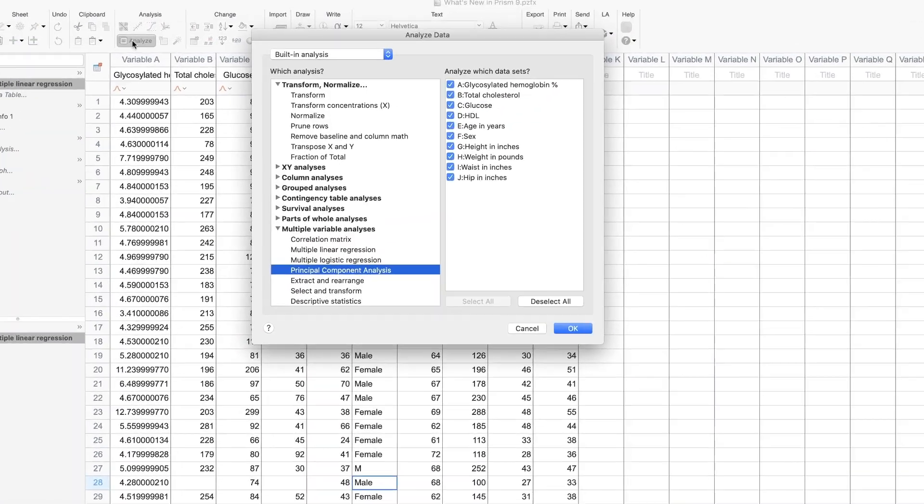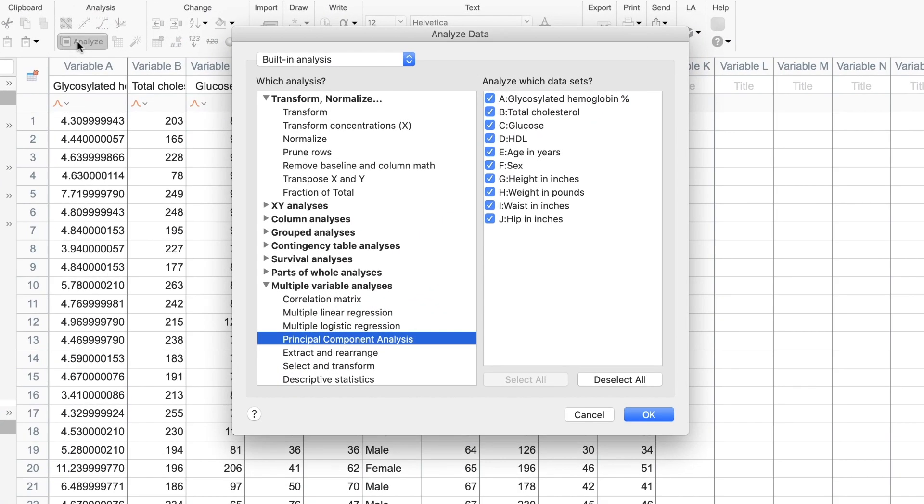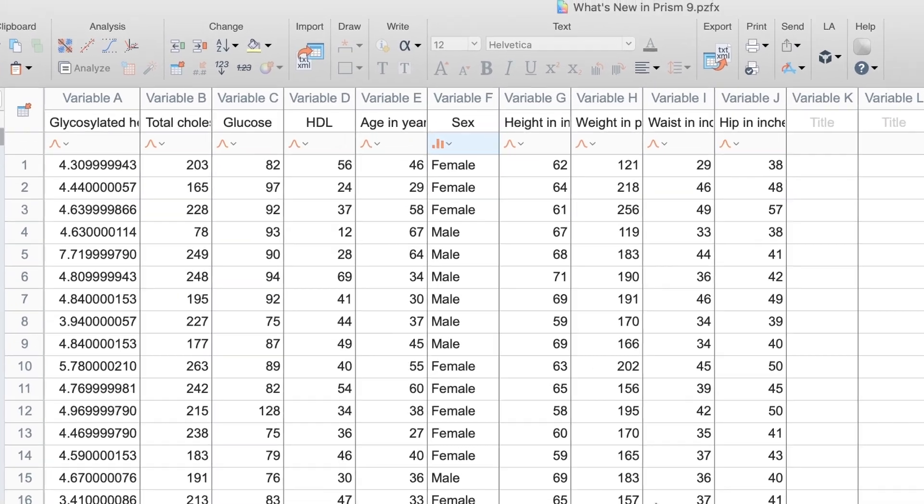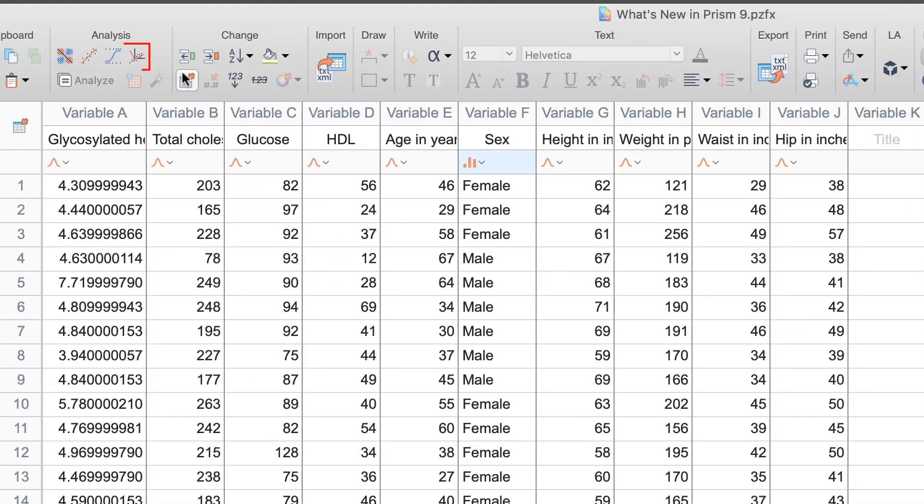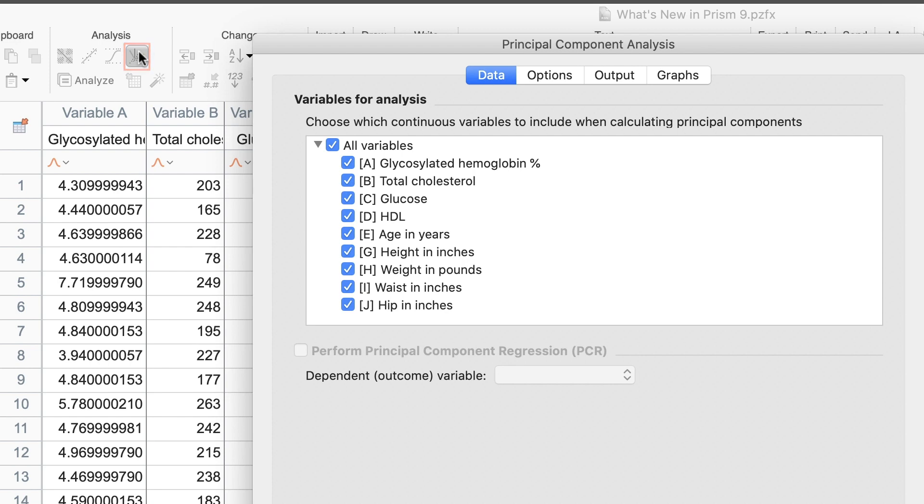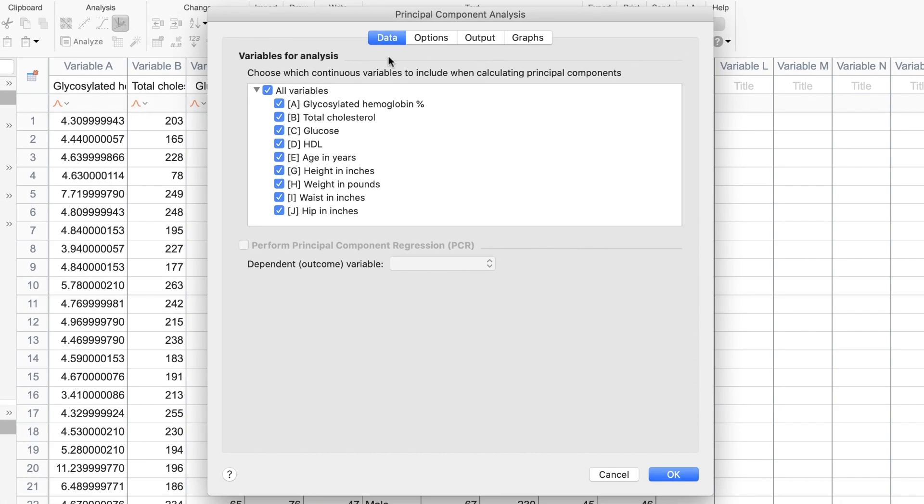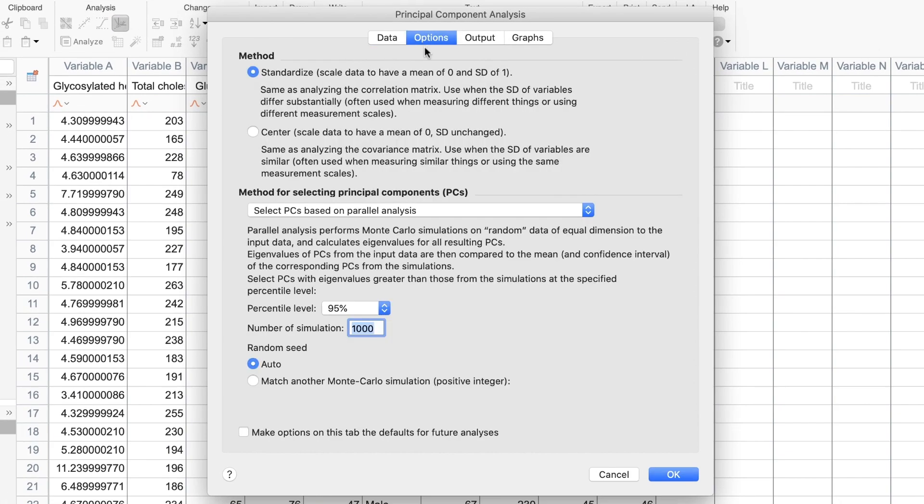Another major addition to the multiple variables data table is Principal Components Analysis, or PCA. PCA is a technique of dimensionality reduction that can be used to reduce the number of variables while eliminating as little information from the data as possible. You can quickly access it by clicking on the PCA button in the Analysis Toolbar. Prism 9 allows both standardized and unstandardized PCA and can decide for you how many Principal Components are needed via parallel analysis.